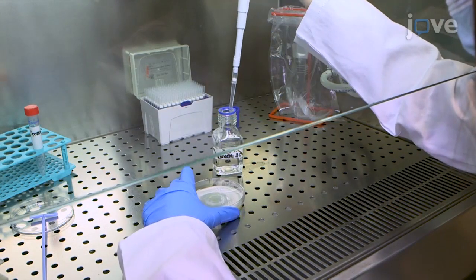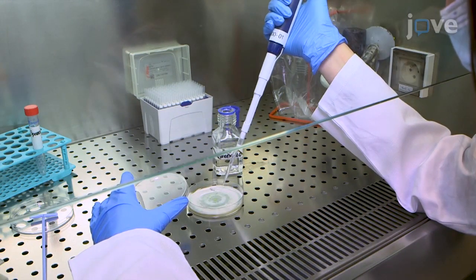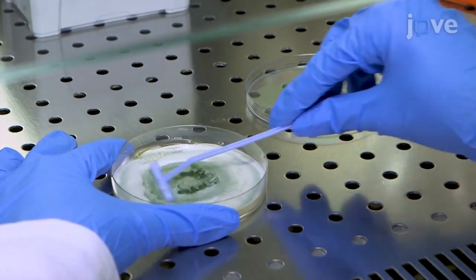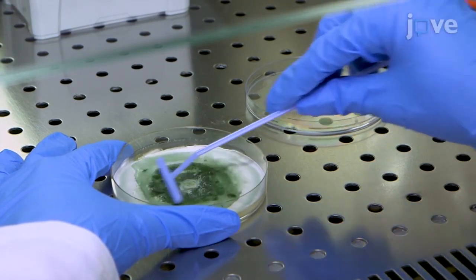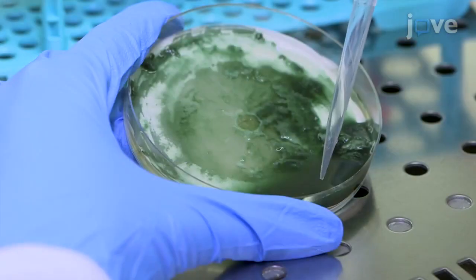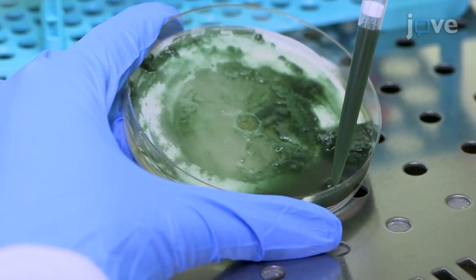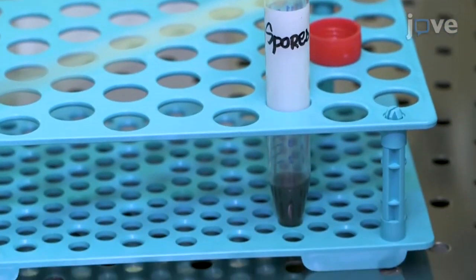In the conidia collection, layer 3 mL of 0.05% Tween 20 on a Trichoderma mycelium culture, and use a rake to release the conidia from the conidiophores, taking care not to press down on the mycelium to prevent the hyphae from being torn away. When all of the conidia have been released, use a micropipet to quickly recover and add the conidia solution to a 15 mL tube for counting.